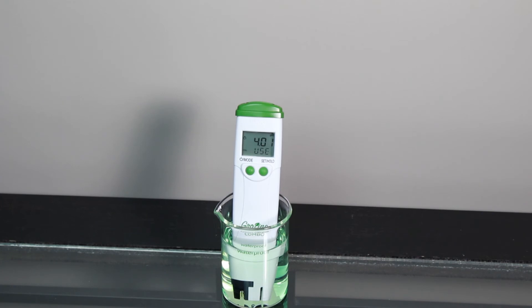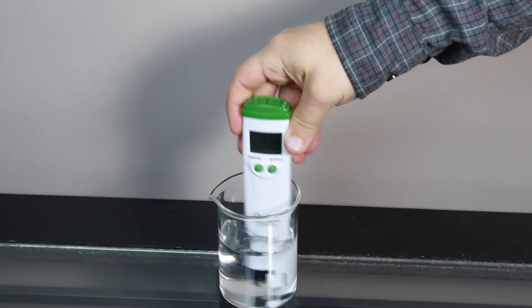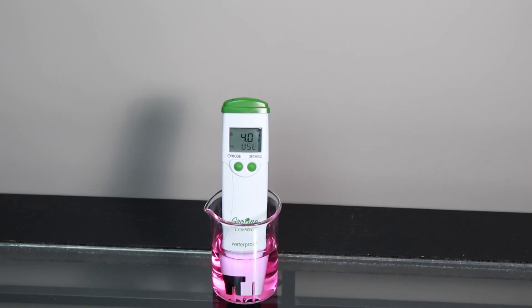Be sure to rinse your tester in distilled or deionized water and place it in the next buffer. Once recognized, the tester will go back to measurement mode and you are now ready to begin taking measurements.